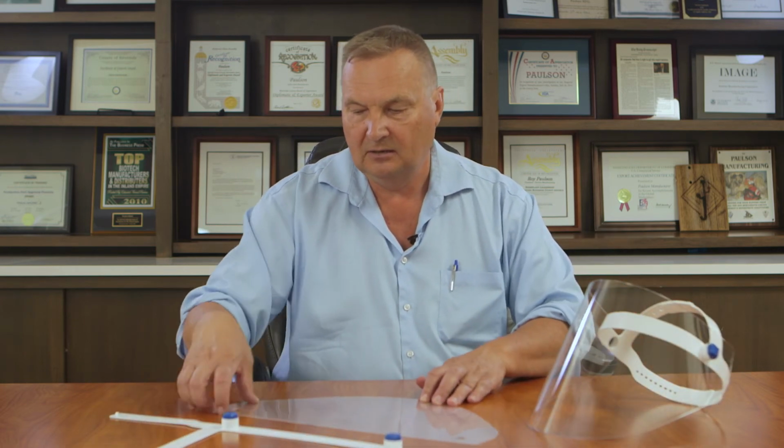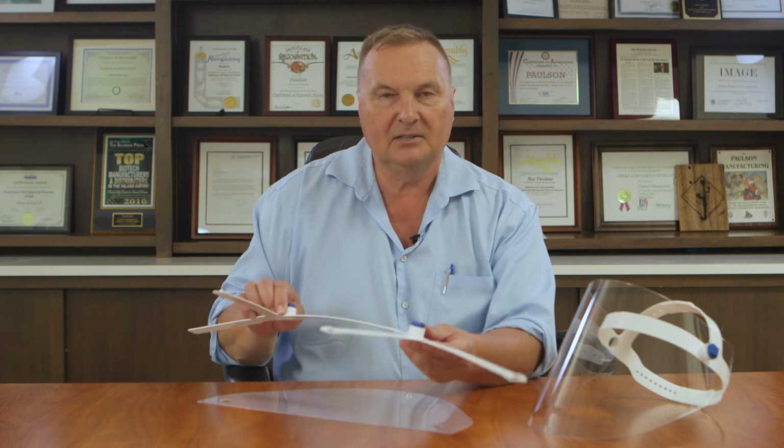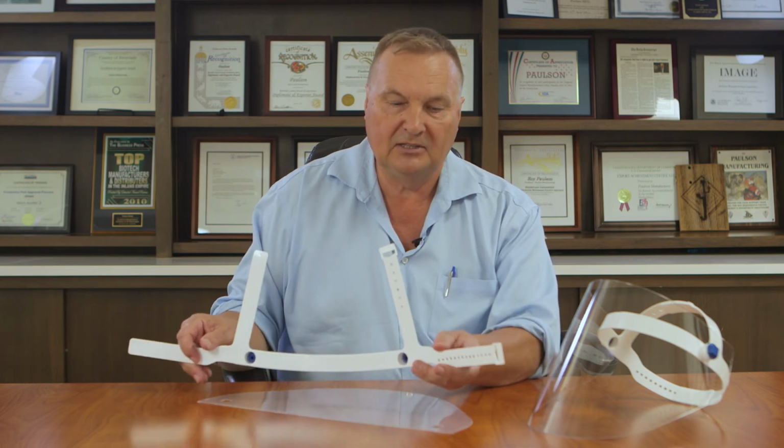The product is shipped flat. As you can see here, the face shield is flat. It has a plastic film that's to be removed. And the headband itself is shipped flat. But as you'll see as I assemble it, it's very easy and quick to do.